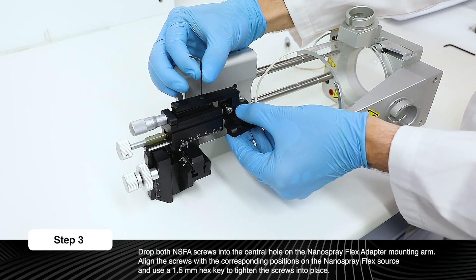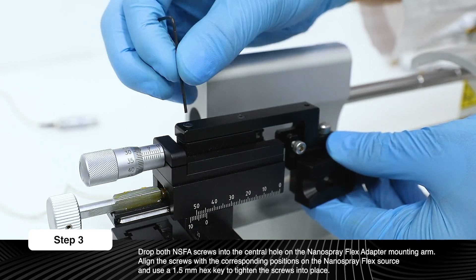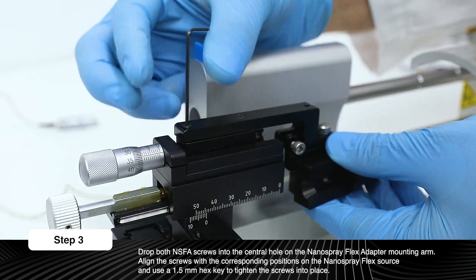Align the screws with the corresponding positions on the Nanospray Flex Source and use a 1.5mm hex key to tighten the screws into place.